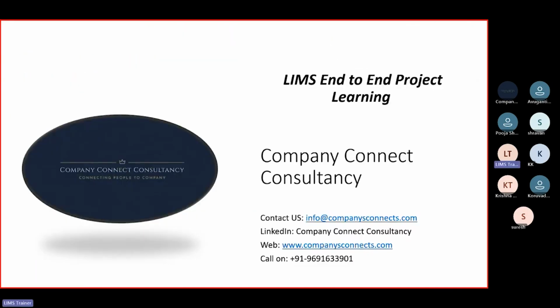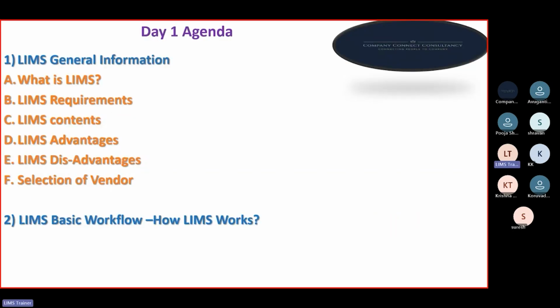So this course will be the end-to-end LIMS learning, powered by Company Connect Consultancy, and I will be your LIMS trainer throughout this course. So we have the agenda for today's demo. We will have the LIMS general information: what is LIMS, what are the LIMS requirements, what are the LIMS contents, some of the LIMS advantages and disadvantages, and then selection of vendor. Then we will see the LIMS basic workflow, how LIMS works.